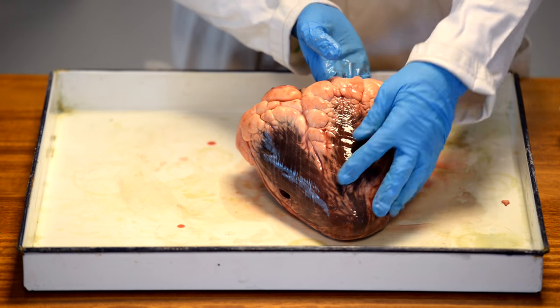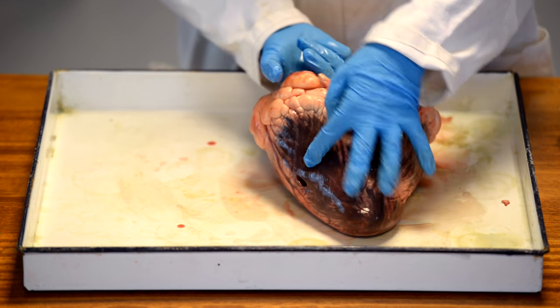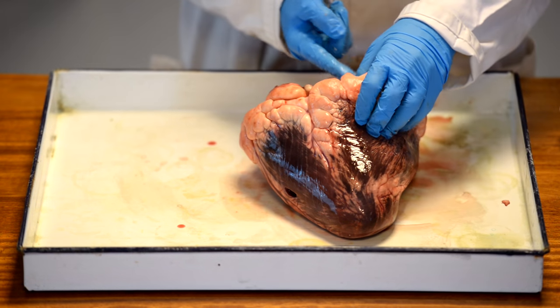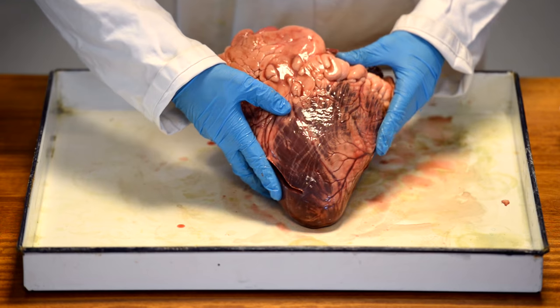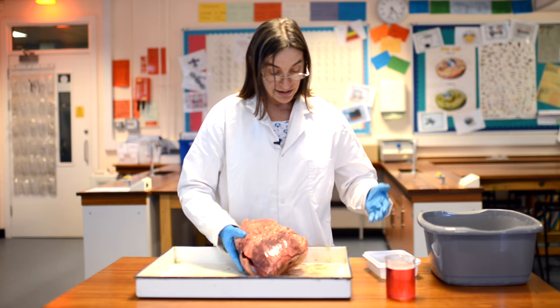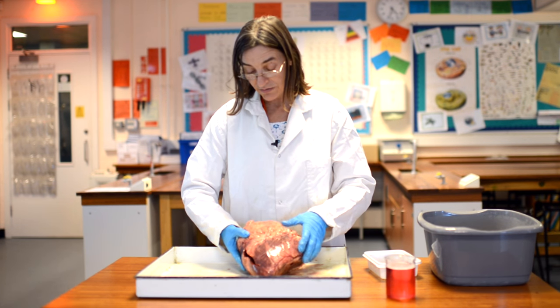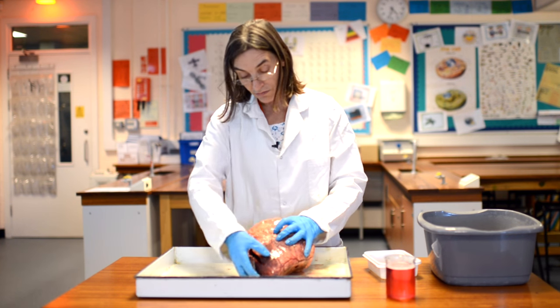I just need to check that I've got him the right way around. If anybody knows what I'm checking for, I'm checking to see how thick the muscles of the heart are, and I need to turn him round. I've got the heart positioned now where he would actually be inside the ox's body. So this is my left-hand side, therefore this is the left-hand side of the ox's heart. This is my right-hand side, therefore this is the right-hand side of the ox's heart.